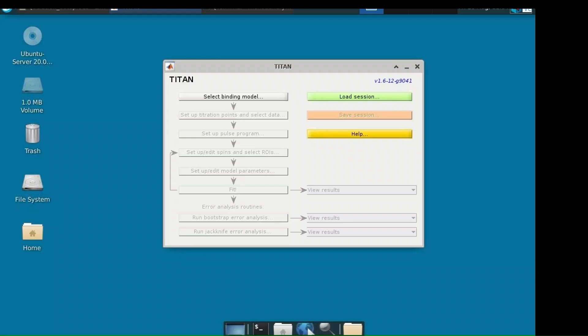Welcome to this Titan tutorial. The purpose of this video is to demonstrate how to use Titan once installed. This can be done by installing and running as an app, running through NMR Box, or in MATLAB.